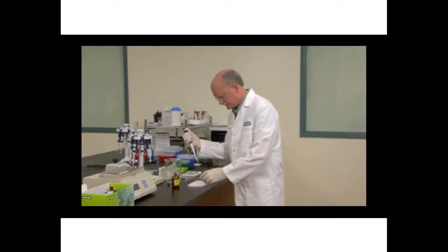Tap the water out into a beaker and then place the gel sideways and remove with a piece of filter paper the excess water from the wells. Be careful not to touch the bottom of the gel as it can damage the surface of the second dimension gel. We usually do this because unpolymerized acrylamide can cause anomalies in your second dimension gel if it's not removed.